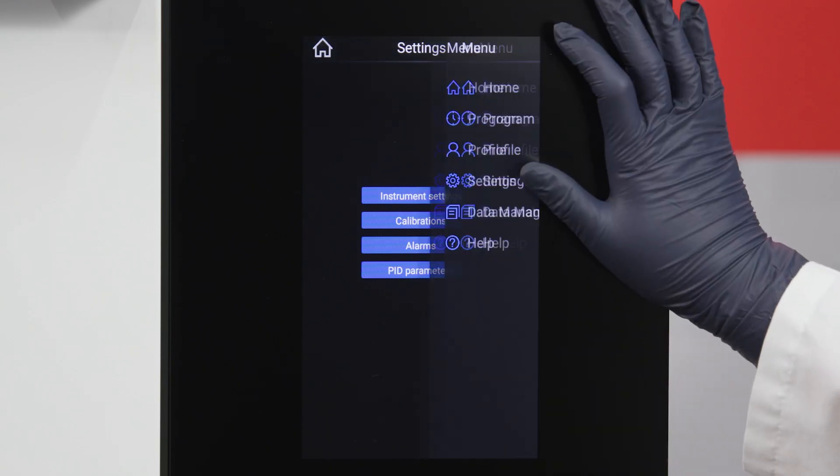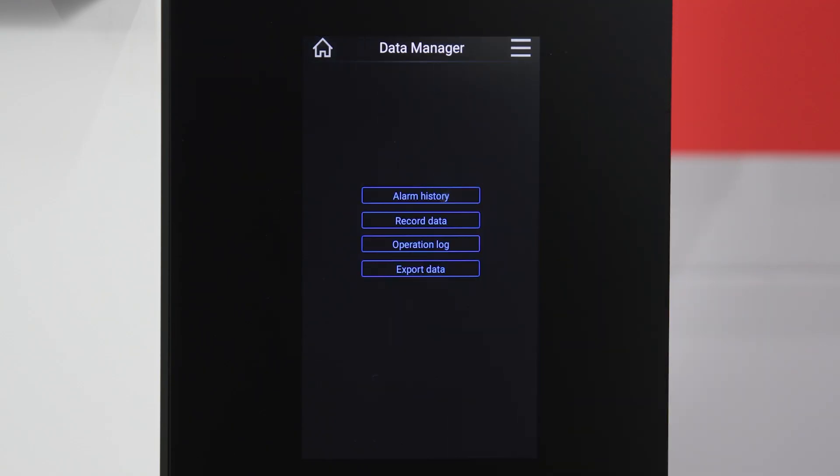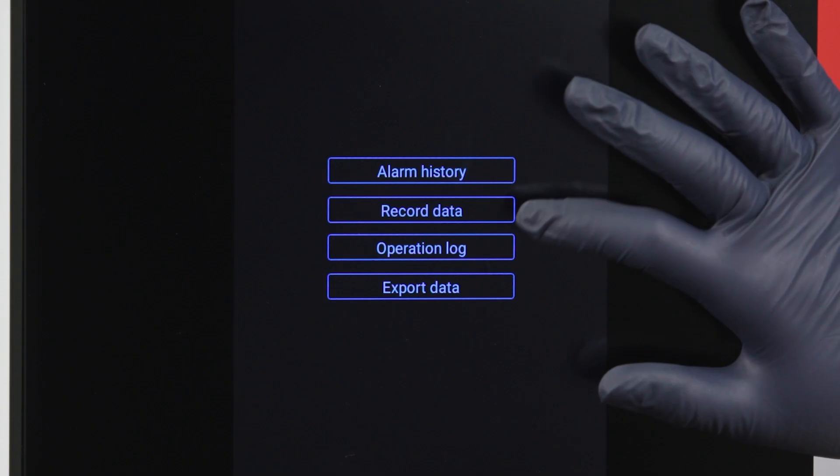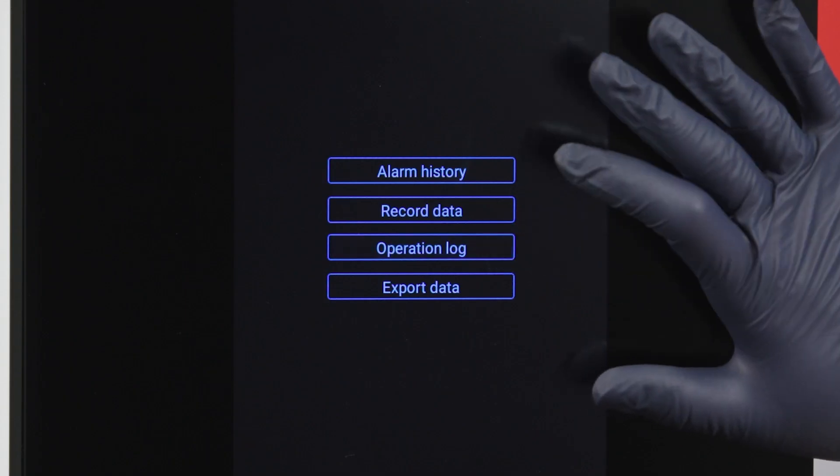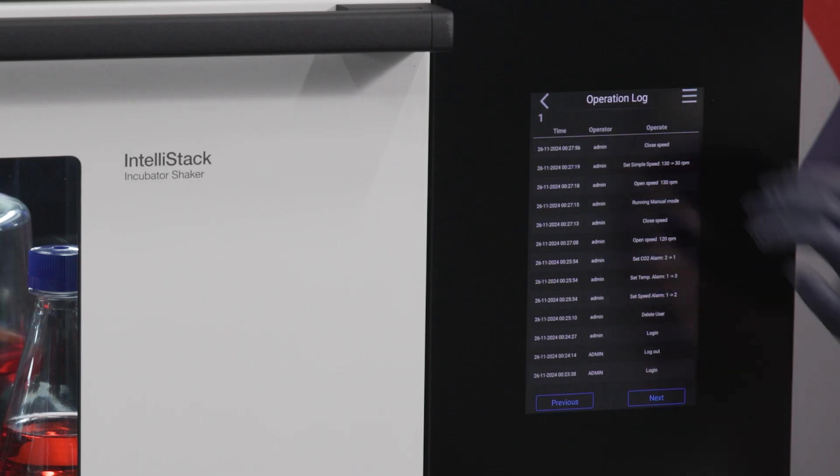Data management gives you access to the shaker's alarm history, recording data, and operation logs. You can also export data from the data manager.